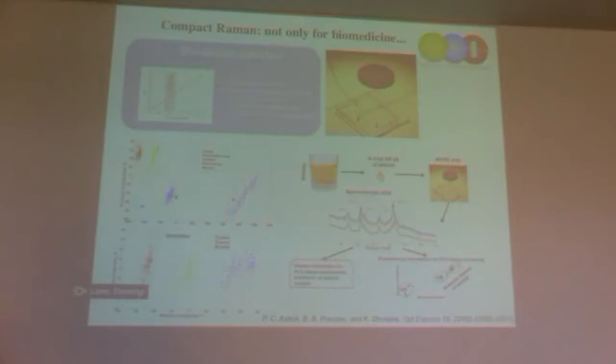I think if I understand, you breathe, and then they take an absorption spectra, and they try and look at the hydrocarbon content in your breath, and correlate that with things like mass spectroscopy. Is it mass spectroscopy? Yeah. Maybe, but then you don't sort of do it on the fly in front of somebody. So indeed, Raman could be used for that, but we'd have to sit down and work out the numbers and see how you'd have to integrate to get a good enough signal. It could be used, there's no reason why.